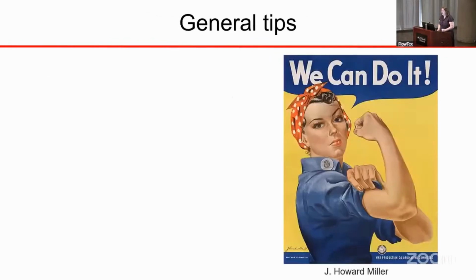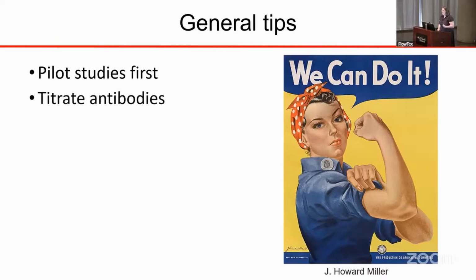But this is a motivational talk, and I'm here to give you some tips on how you can actually process those. So just some general tips that you all know, but I'm going to reiterate. First, we always recommend doing pilot studies. Don't waste your precious samples if you haven't nailed down the protocol. The second, and this has been repeated ad nauseam, I know, at this FlowTex talk, but titrate your antibodies.